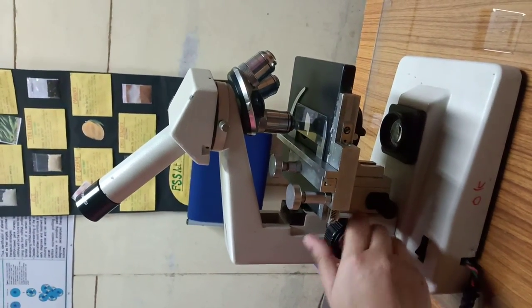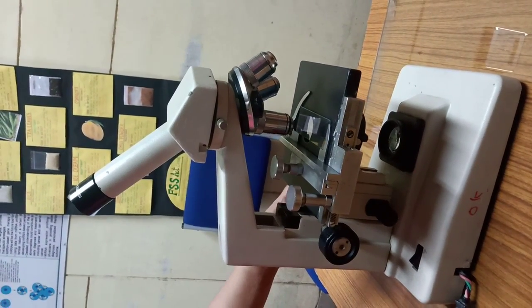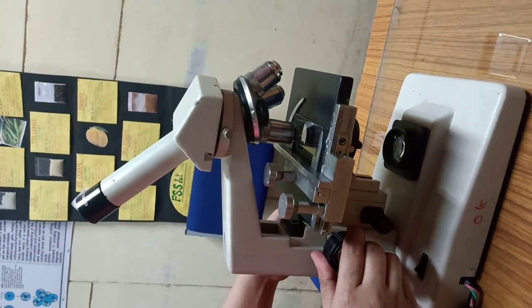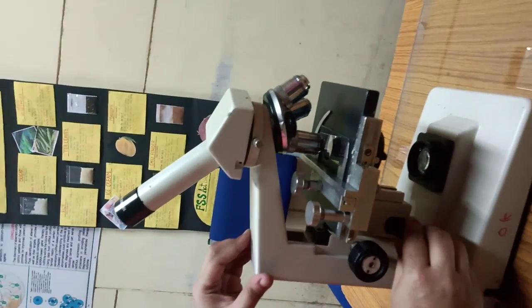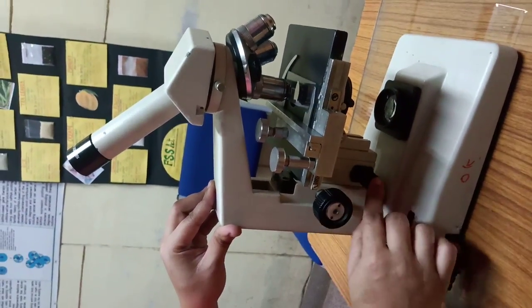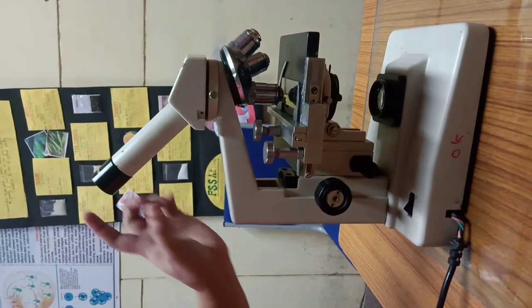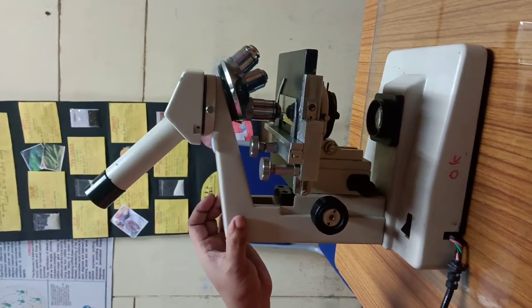Coarse adjustment knob will help you for the first stage of focusing. Once you focus and you visualize the object from the ocular lens, you use the fine adjustment knob to make it even more clear and to set the resolution correct, so that the image is not only magnified but is very correctly and finely viewed through the ocular lens with your eye.